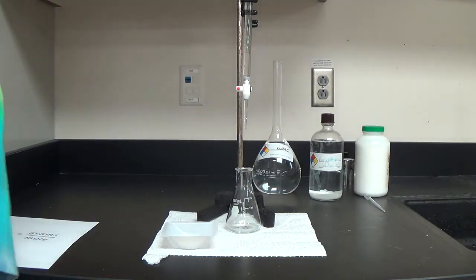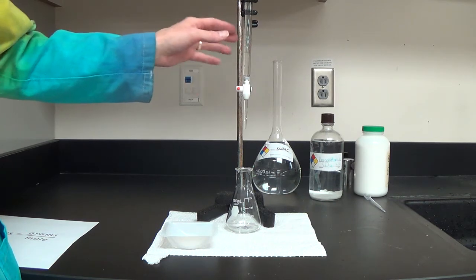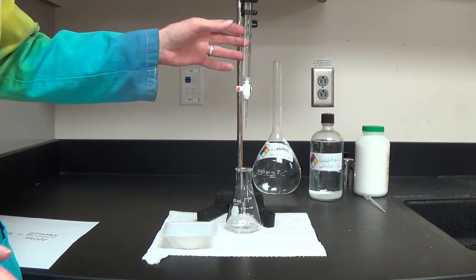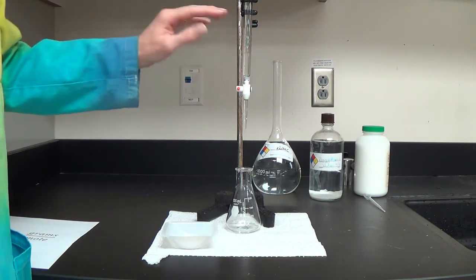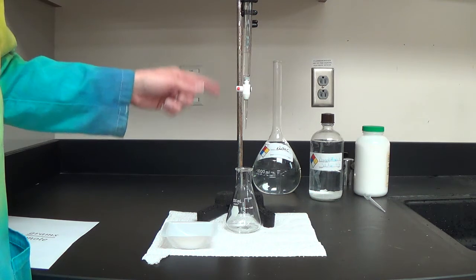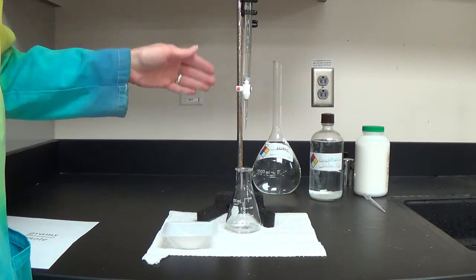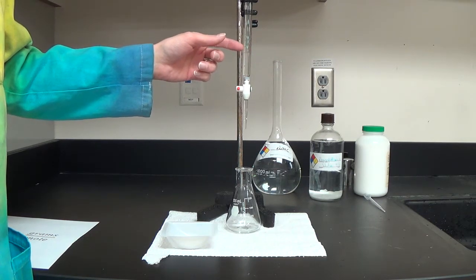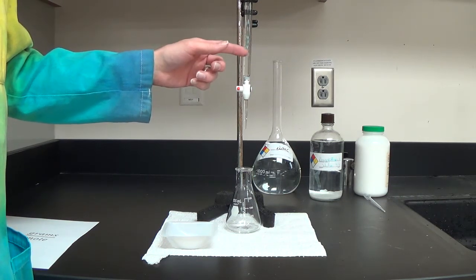I want to show you this setup. I have a burette and a clamp up here and it is closed. I point out I have double rinsed the burette. When you wash it out with water, there's still water clinging to the surface of the glass or plastic. That water will dilute the solution we're about to put inside, especially with the large surface area for the volume that a burette gives us.